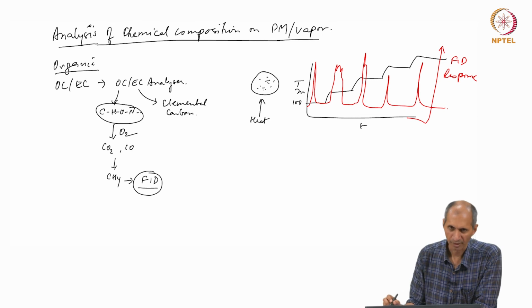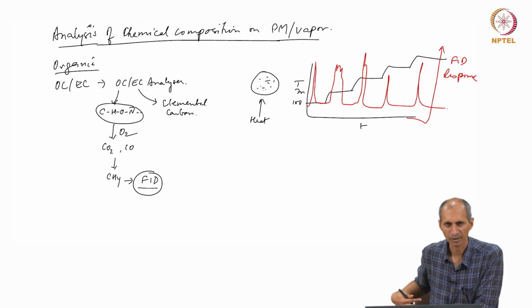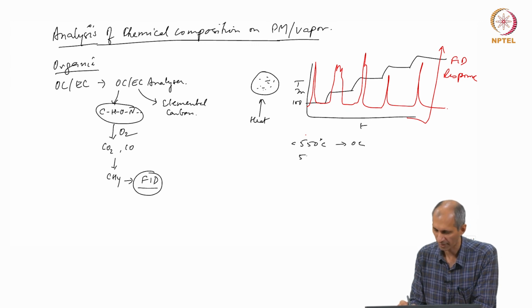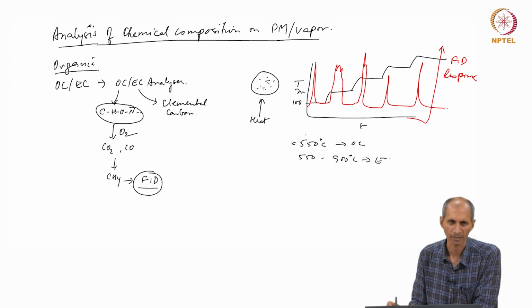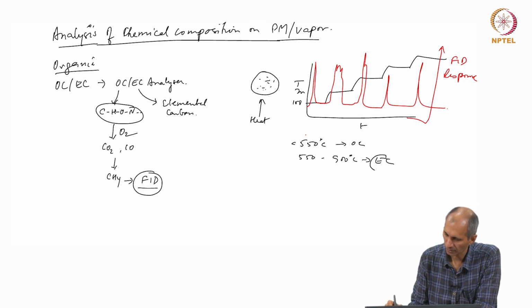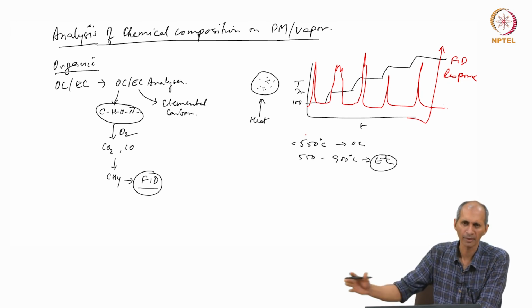Beyond 500 degrees an optical method is used at higher temperature, it goes up to 900 degrees centigrade. Up to less than about 550 degrees centigrade is the organic carbon. Somewhere around 550 to about 900 degrees centigrade is the elemental carbon, because this will not become carbon dioxide or anything, it will stay as it is as soot. Since it is not going to form anything else, there is another method of measurement which is optical at that high temperature. What is reported is different fractions of organic carbon and different fractions of elemental carbon, but all the elemental carbon can be clubbed in one group.